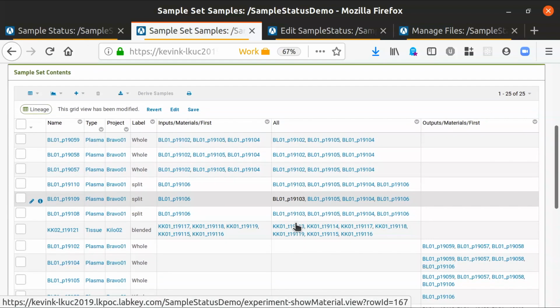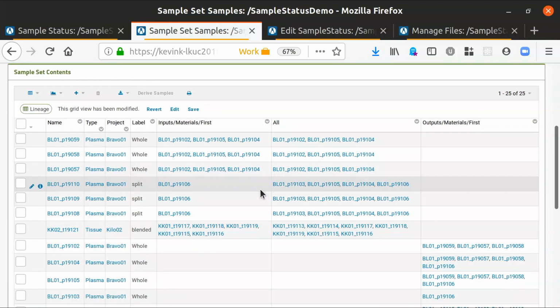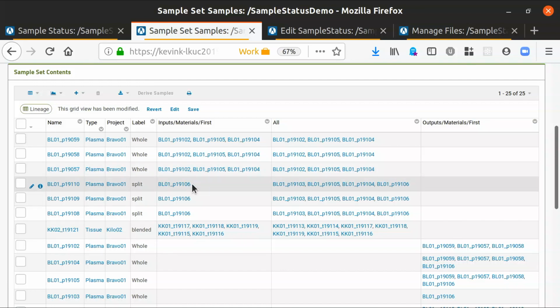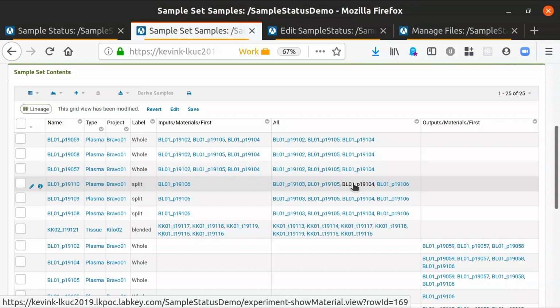So it represents it the same as if it was first, right? It's just a comma separated list. It doesn't indicate the depth of the lineage within this view. That's why I said that the Lineage API gives you more details about what's going on. Whereas here, this is my immediate parent, but then here are, maybe it's my grandparent, maybe it's my, I don't know how many generations back, right? Yeah.